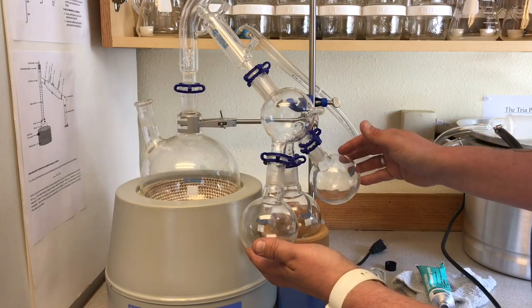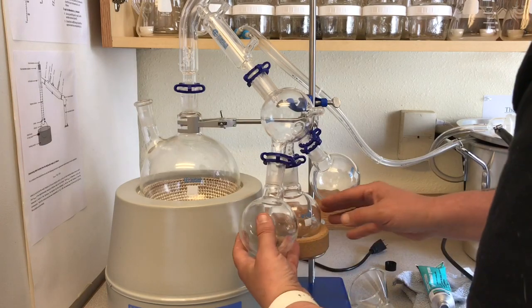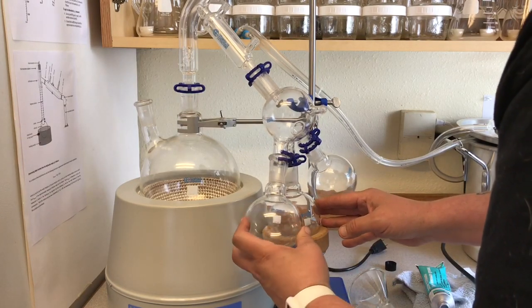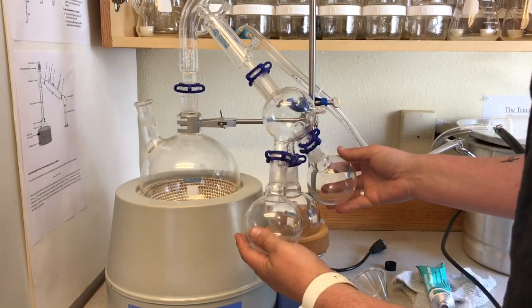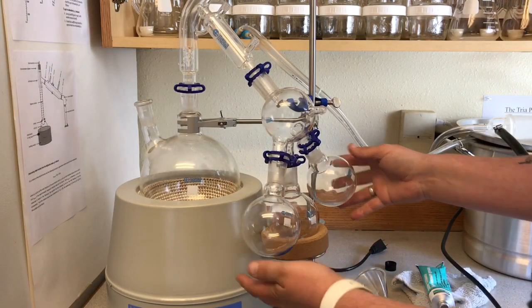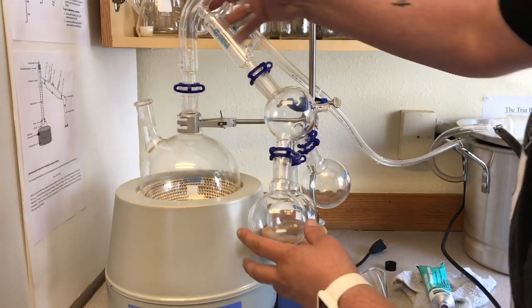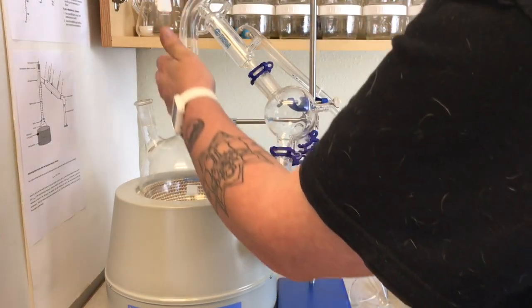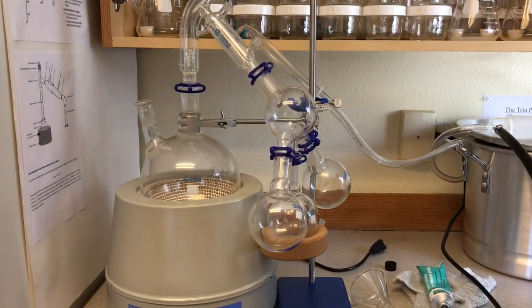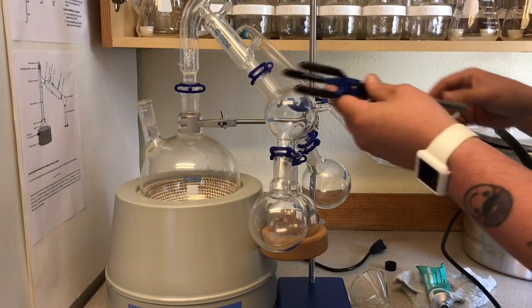You'll begin with your first reception flask, go into your body, and then do your tail here. So we want to make sure that this apparatus has the ability to swing back and forth. And these are 250 milliliter collection flasks here. And when we're setting this up, we want to make sure that this column is straight up and down. And so the next piece that we can add will be our arm retort here.